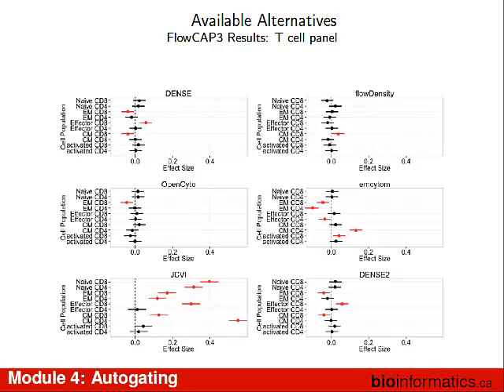Now we've gated that data by hand, and we've gated that same data on the computer. What extra effects are there due to that kind of gating? You want to take away all the effects that you know about, and then hopefully when you look at manual versus automated, there is no difference left over. After you account for all those effects, we look to see what's left over, and that's how we get those red lines.